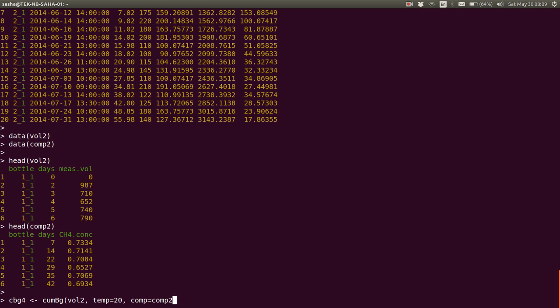Say comp is comp2. id.name is now bottle instead of id. time.name is days here. dat.name, mes.vol, comp.name, ch4.conc. And I'll also say extrap is true.